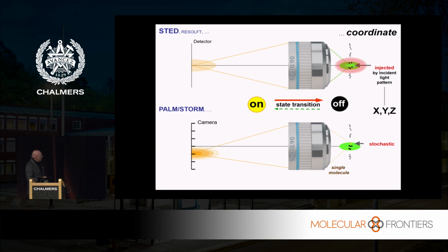And the second condition is that many photons are emitted from the molecule consecutively, so that you can associate these photons to that particular molecule in the on state. And now, if you're getting, say, n photons, 10, 100, or 1,000 photons from that molecule, you will get a pattern of light in here.